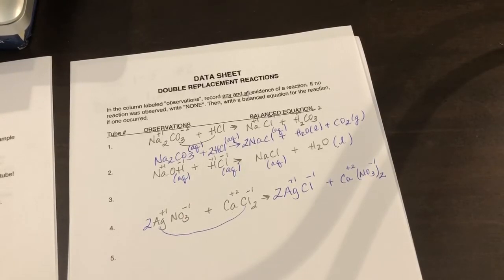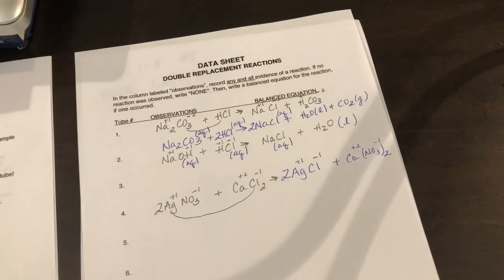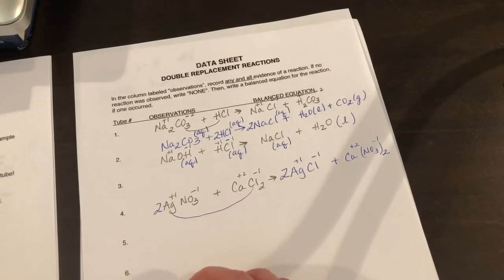Let's look at number 7. Let's do 7 together. Number 7 says we're going to take a small amount of calcium carbonate. So calcium is Ca with a +2 charge. Carbonate is CO3 with a -2 charge.